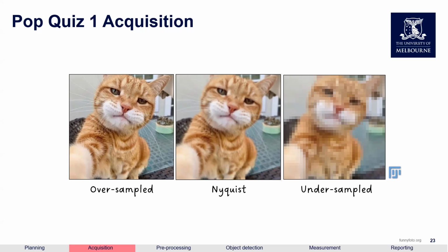And for the second question, in terms of the bit depth that you want to use for intensity measurements, I'll say anything higher than 8-bit. So in this case, I put it as 16-bit, but also if your camera only has up to 12 bits, that's still fine, still a lot better than 8-bit. So please have that in mind.